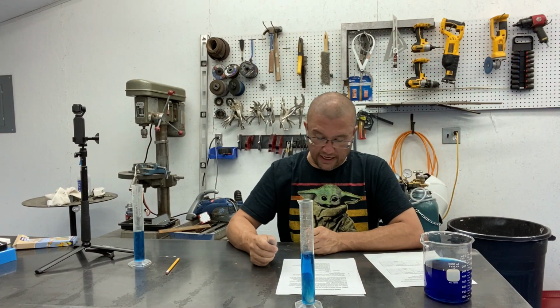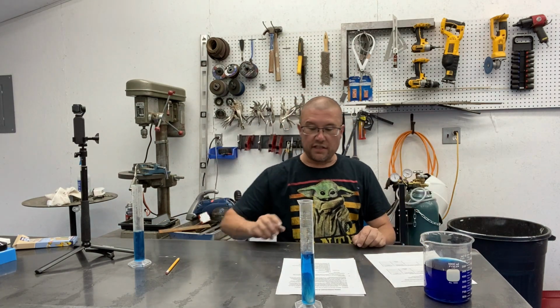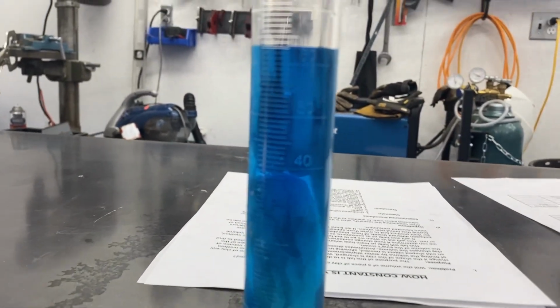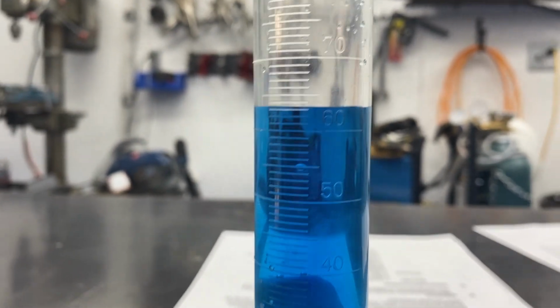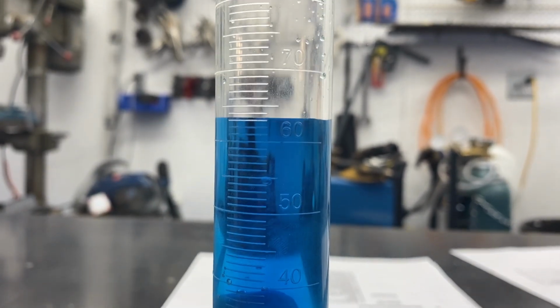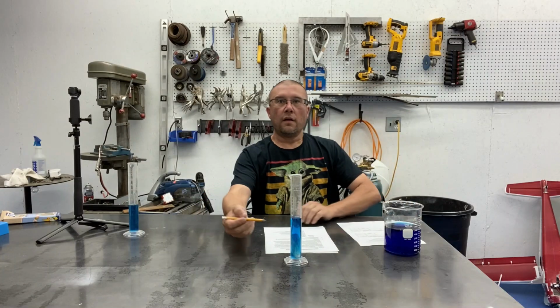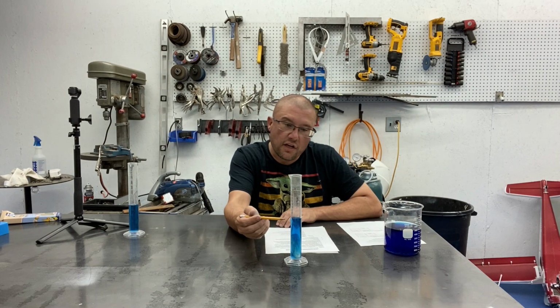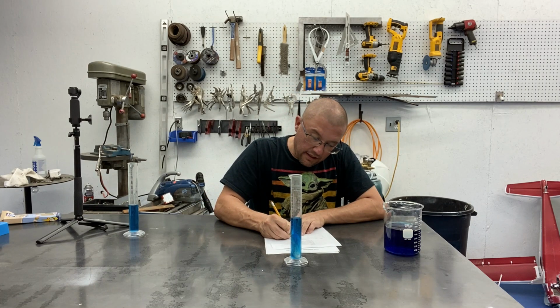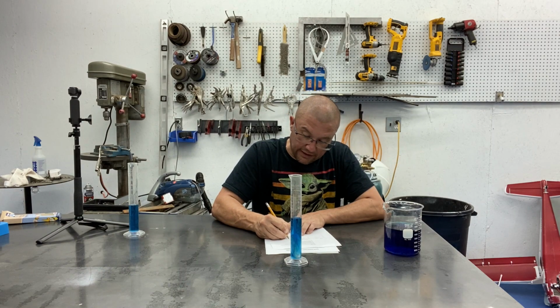So we've lowered the clay into the graduated cylinder. Now we need to read the new volume level, the new water level. So let's take a look at that. So for test 1, volume of water and clay, we'll zoom in here and you can see we've got the big line at 60 and then we're 1, 2, 3 up. So this has 63 milliliters. So we saw that the water has gone up to 63 milliliters. You're going to record that in trial number 1, volume of water and clay, 63 milliliters.